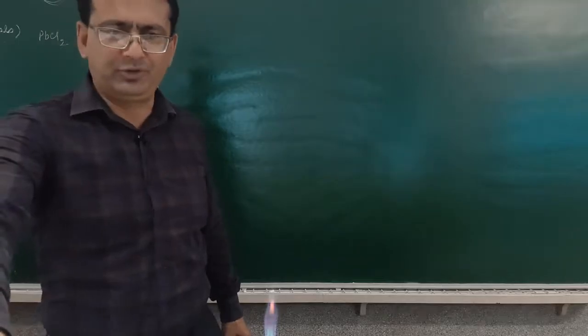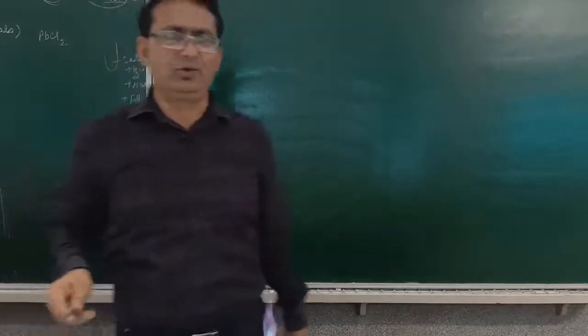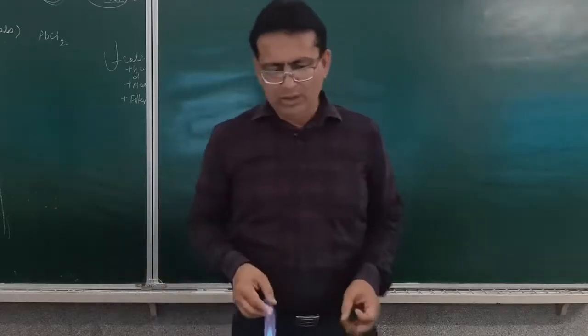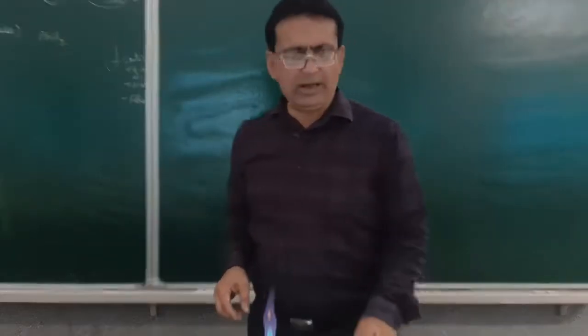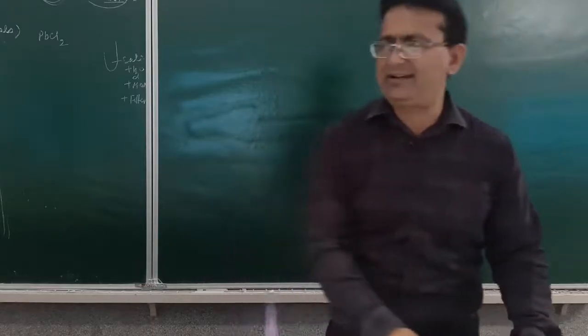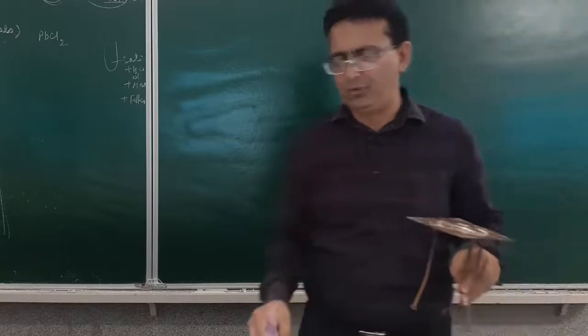First test on page number 2 is a nitrate anion. You may see those tests. Is it clear? Now the second test of a nitrate ion is to be done by use of a sodium carbonate extract. How do we prepare the sodium carbonate extract?